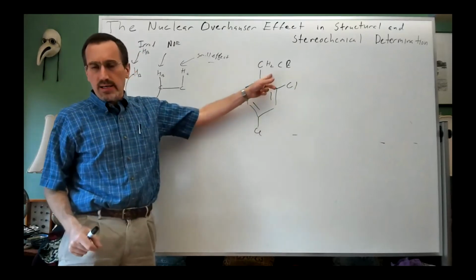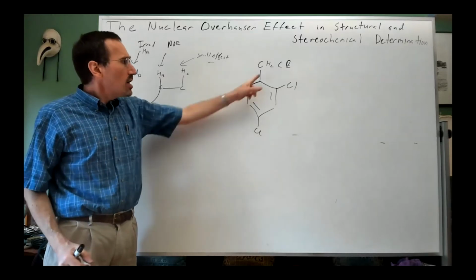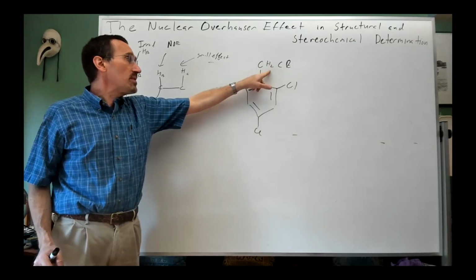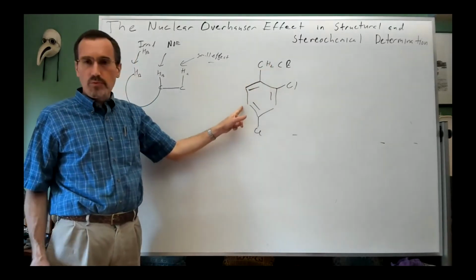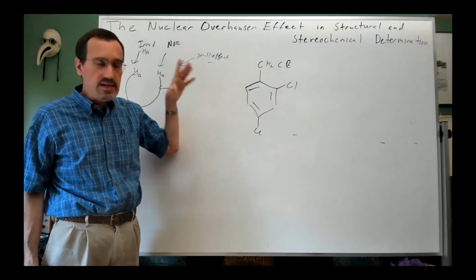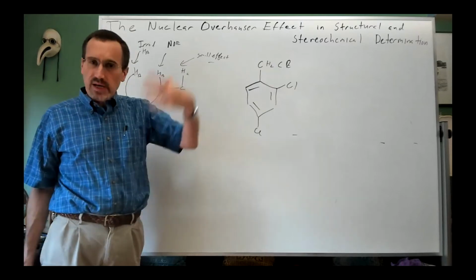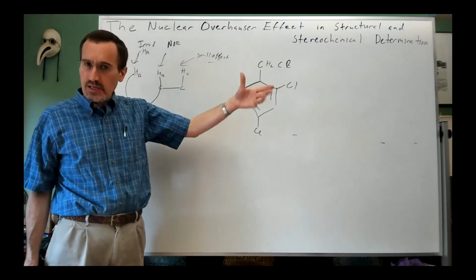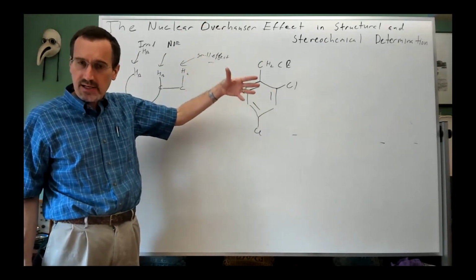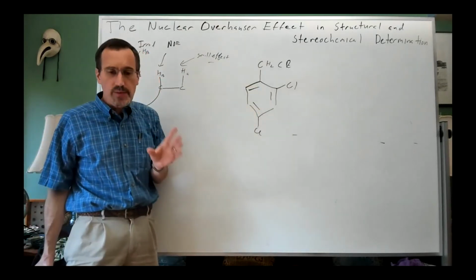And this is sort of similar. Remember when I was talking about determining the regiochemistry of substitution? So imagine for a moment you were trying to identify the position of this chloromethyl group on the ring. We've talked about other examples, and of course in homework in the midterm exam, in problem number 2, we had that compound with the methoxy group and the hydroxy group and the CH2 group all attached to one aromatic ring in a 1-2-4 substitution pattern.